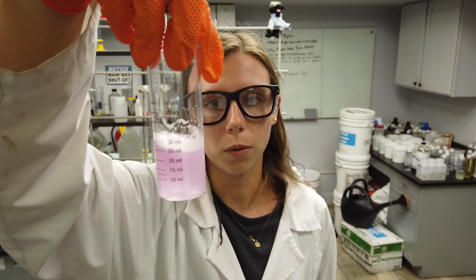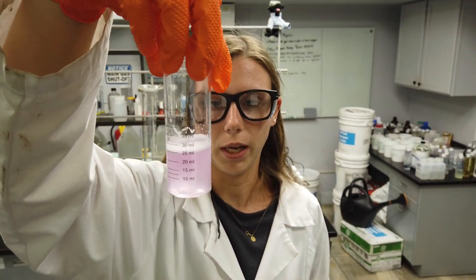And as you can see on the thirteenth drop, the color persists and it's a faint pink. And that's about 10.4 percent. Thank you.